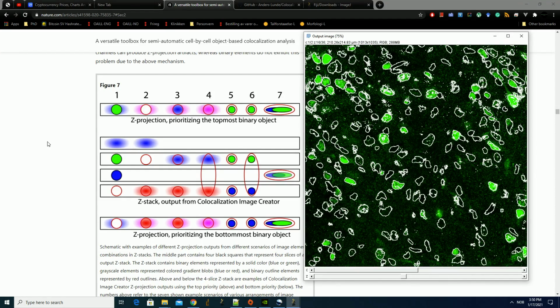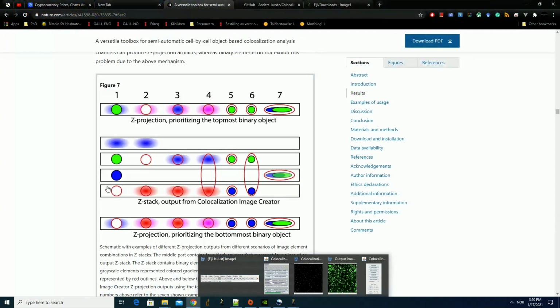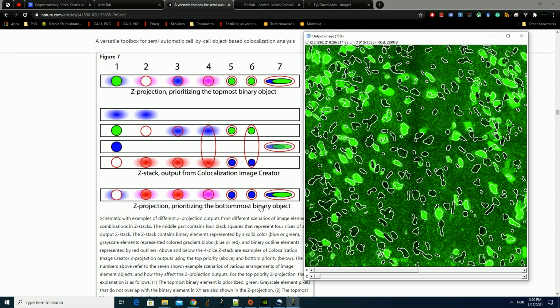And then what we thought was one way to do this was to say that, okay, we can't watch both of the cells at the same time in a good 2D representation, because that's simply not possible.